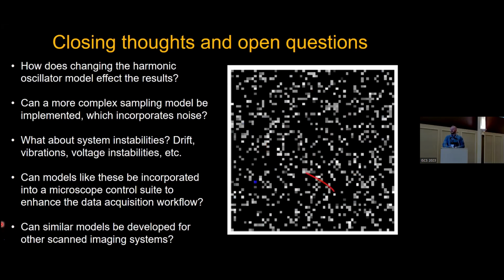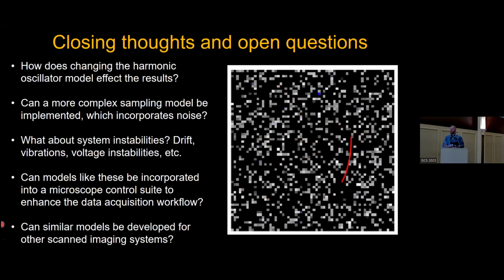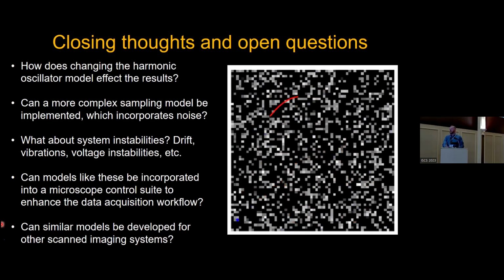Yeah. So the other side here is if you can measure the probe location, the actual location, this model is just good for helping you before you go to the microscope. If you're doing iterative design where you don't want to get on a microscope, which is an expensive endeavor, 20,000 a day, you can do your testing here if you have a good model. The other side of it is if we can't measure the probe location, which we don't know right now, models like this will have to be used to inform that missing information. If your model is well representative of your microscope, you might not need to do the measurement, especially if it's not possible. So that's how we posit that this is going to go.